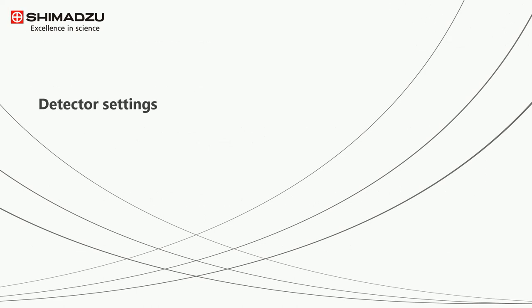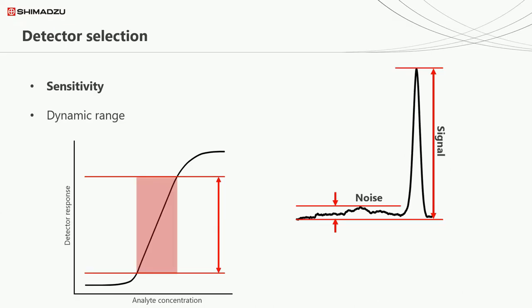If you've made it this far, well done, the hard work is over. We should take a few moments to discuss detector choice. This is far less complex than the previous sections, so don't worry. Selecting a detector is usually pretty straightforward. There's a finite choice, and you're going to be guided largely by sensitivity.